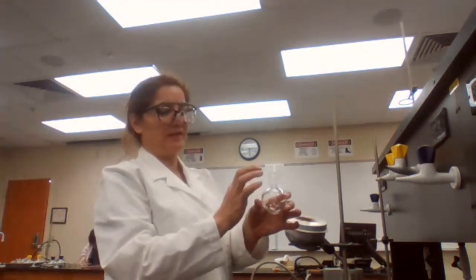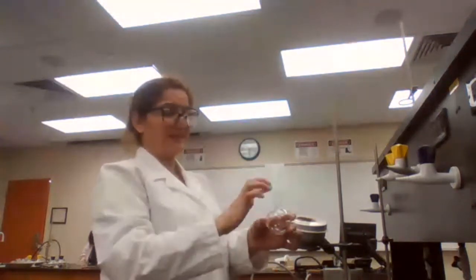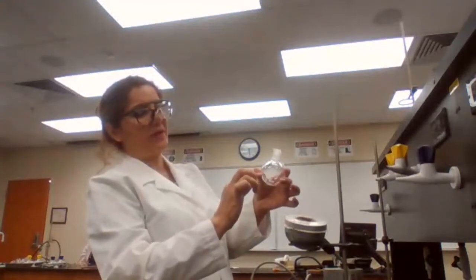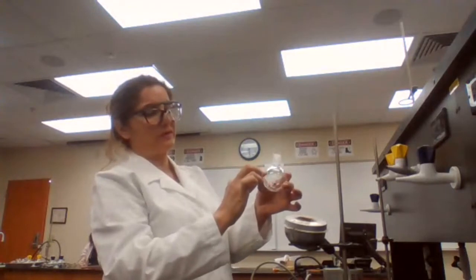A lot of vapor is going to be trapped there, and it doesn't make it to the condenser. So basically, your percent recovery is going to be lower, because this space is taking some of the vapor, and it has to be filled up completely before it actually escapes the flask and goes to the condenser. So the proper level is between 1/3 and 2/3.